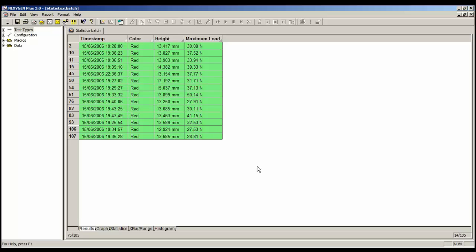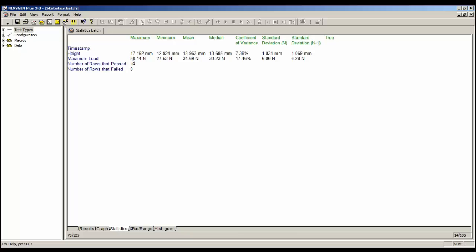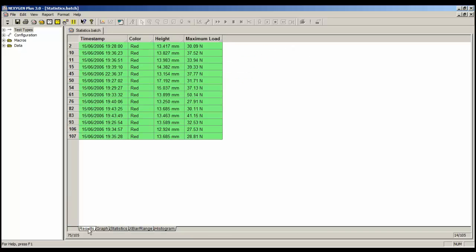If you print a batch report anything that is visible in this data table and the corresponding statistics will get printed. So it's easy to print a report for example the red colours, the red samples.